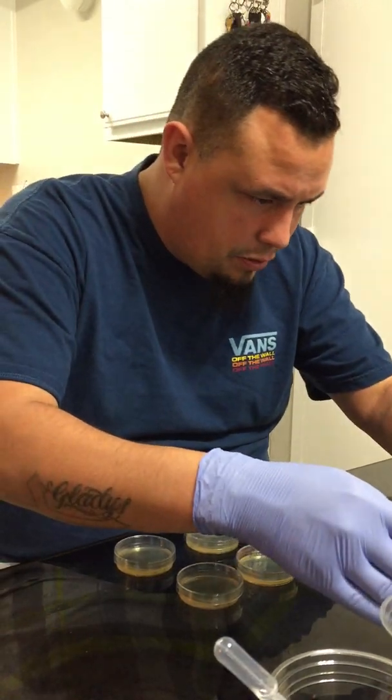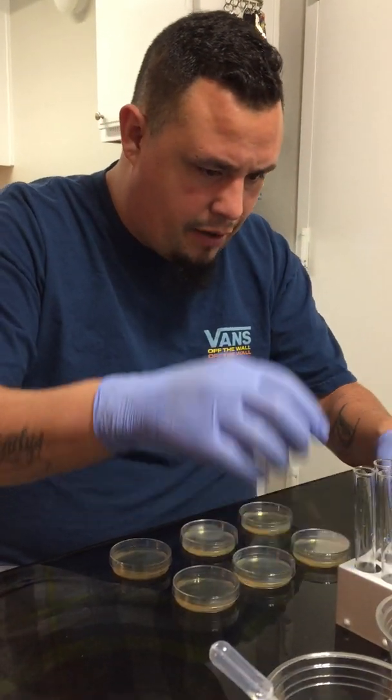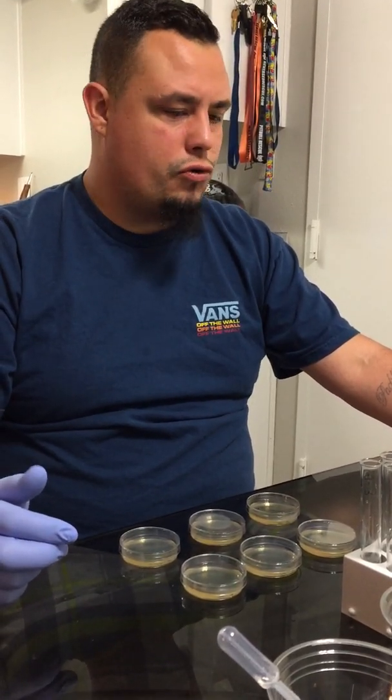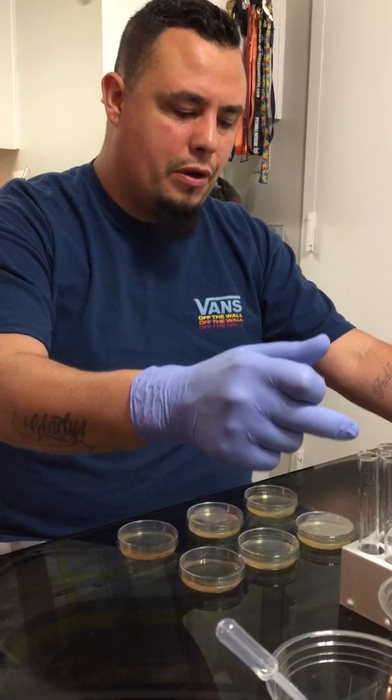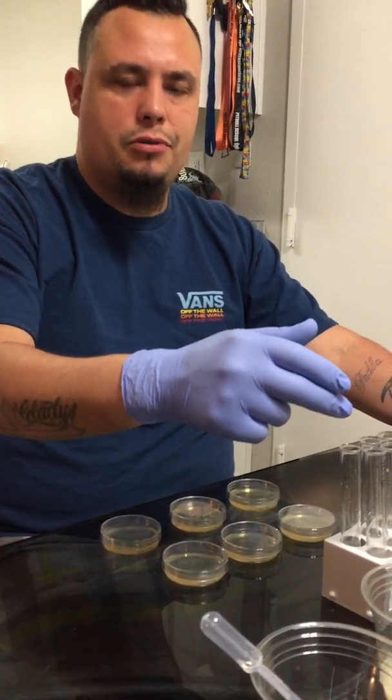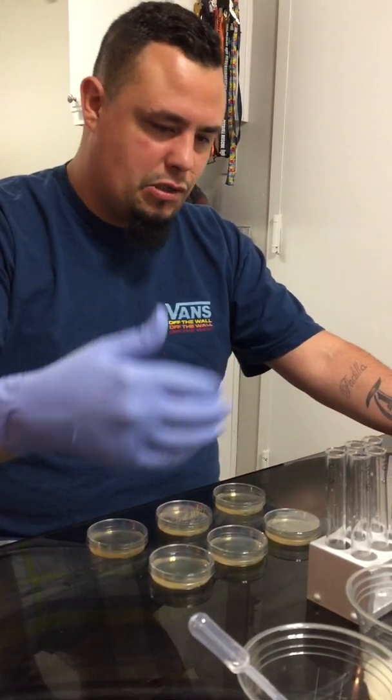What we're going to do is add from 1 to 1, 2 to 2, 3 to 3, 4 to 4. We're going to pipette 0.125 mLs, which equals out to about 4 drops. So we're going to do 4 drops from the number 1 tube into the number 1 plate. Then we'll do 4 drops from the number 2 tube to the number 2 plate, and so on.